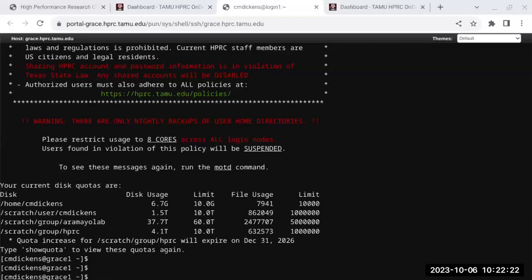All right. This is what I mentioned earlier. You want to maintain the read pair order. Sometimes all the fragments are the exact same length, especially if they're the shorter fragments off of one of the larger sequencers. The MiSeq can do some initial trimming. So you might see the forward reads are one length and the reverse reads are a different length.